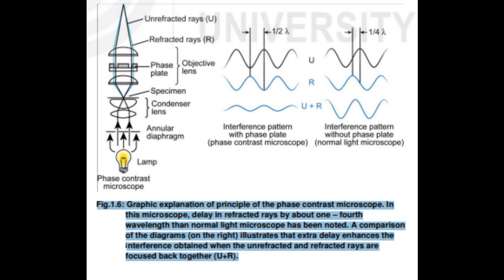Hence making the object appear bright against a dark background. This type of microscope is suitable for observing living specimens.